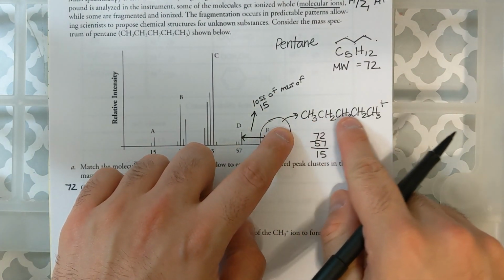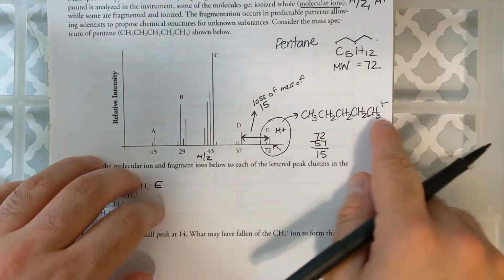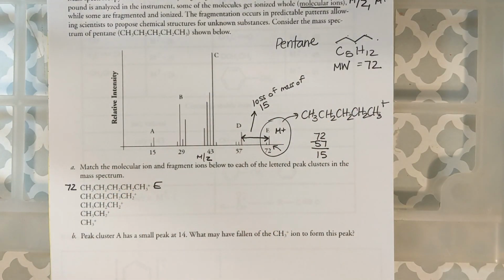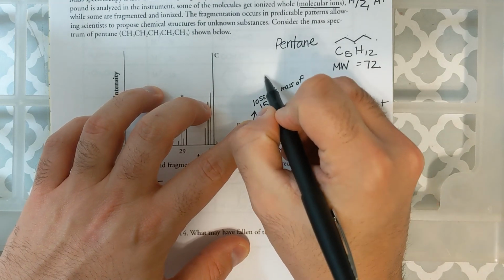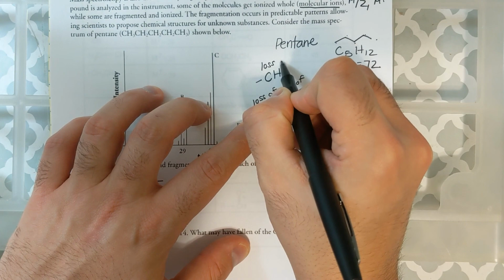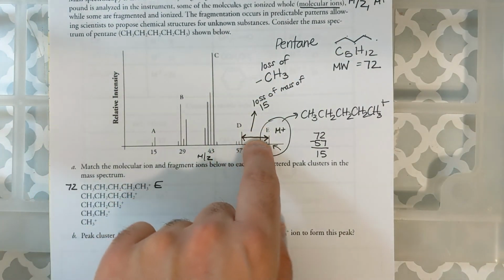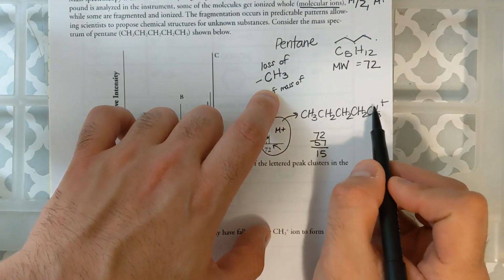Something must have come off this molecular ion that has a mass of 15. Well, what in this structure will give me a mass of 15? I mentioned this earlier, but if I ever have a loss of 15, I must have lost a CH3. A mass loss of 15 means I lost a CH3.